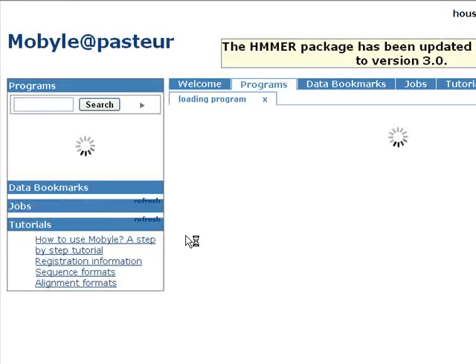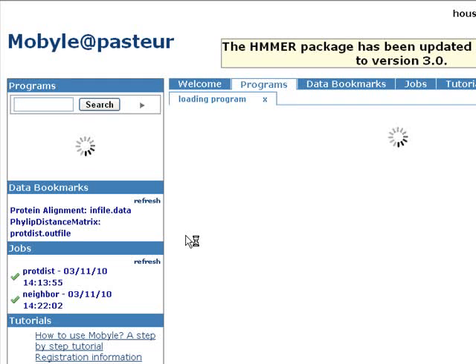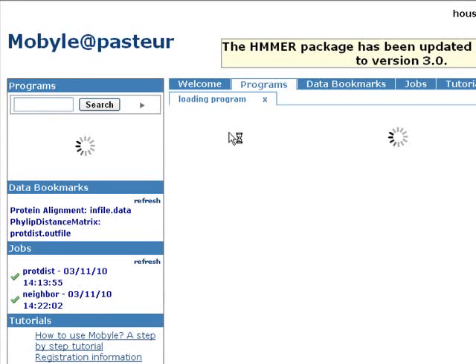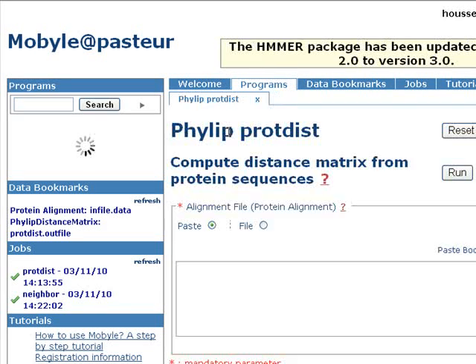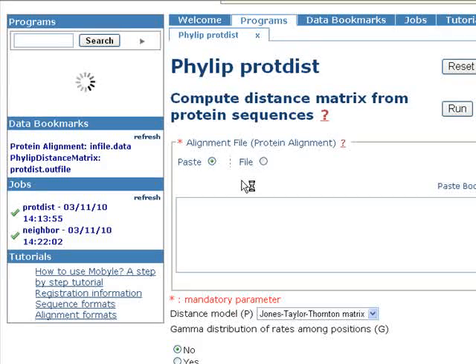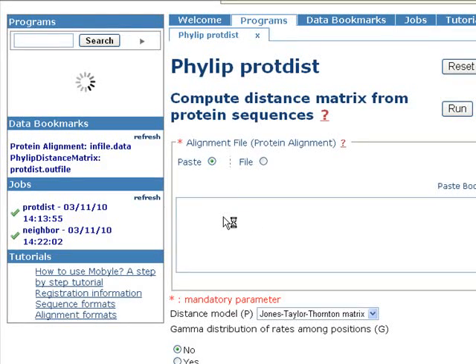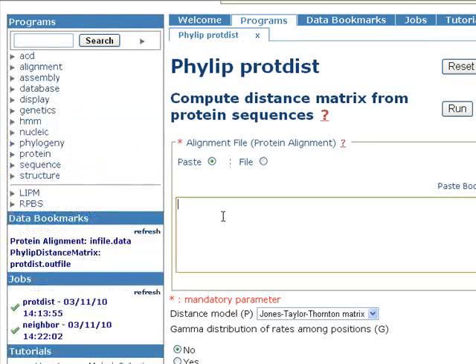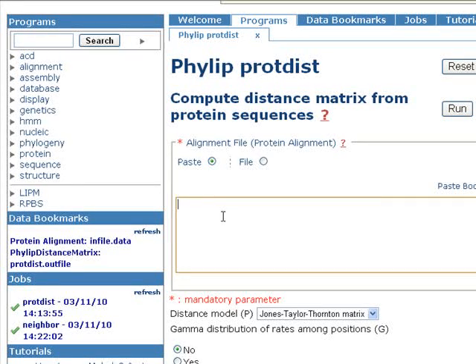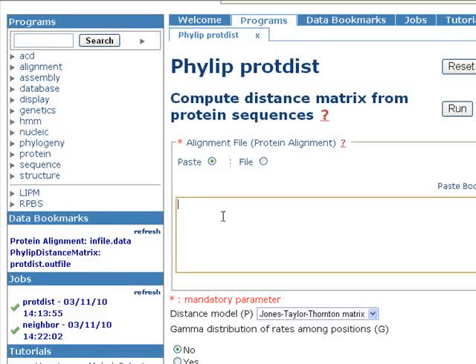And we'll wait a little for the program to load. Okay, this is our program. Here you can paste your multiple sequence alignment produced by, for example, ClustalW. And if you are just testing this program, I advise you to go to this web address.